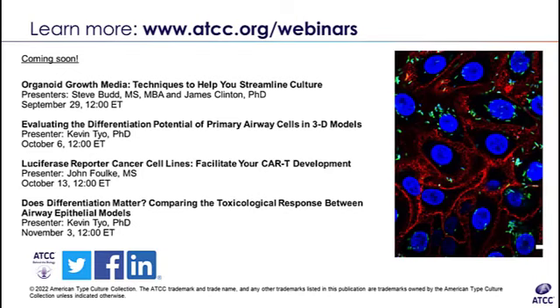It's generally not advised to submerge cell vials inside liquid nitrogen, mostly because any sort of cracks or openings in the vials mean that liquid nitrogen would be able to get into the vial. And then when you take it out of the liquid nitrogen, that's just going to rapidly expand and could cause an explosion. By explosion, I mean the vial exploding. So in terms of storing cells, you should have enough liquid nitrogen in there to keep the tank cool, but you definitely want to store cells in the vapor phase of liquid nitrogen and not submerged inside liquid nitrogen.